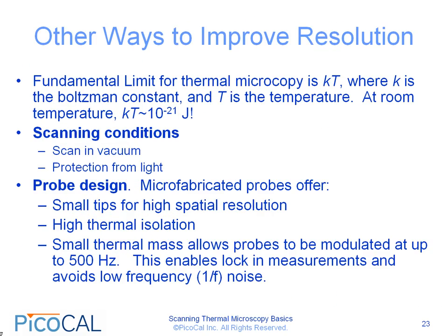Other ways to improve the resolution. The fundamental limit for thermal microscopy is kT, where k is the Boltzmann constant and T is the temperature. At room temperature, this value would be equal to 10 to the negative 21 joules, which is a very, very small amount of energy. Typically, under regular scanning conditions, the noise limit is much, much greater than that.